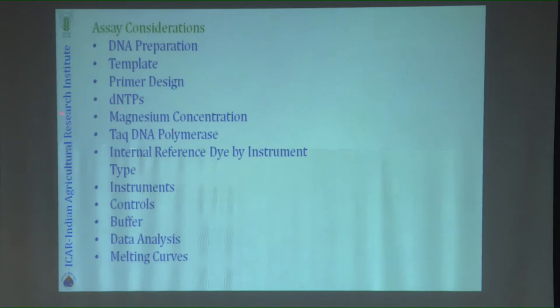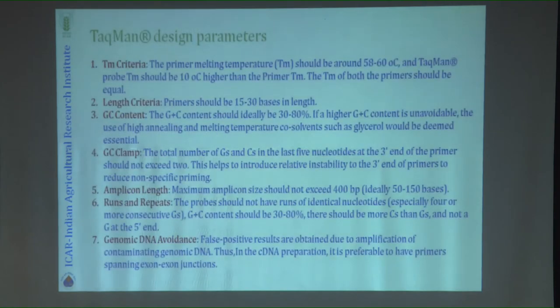Sometimes students, actually in my lab, they prepare everything, but they forget to add DNA. So I know one of my students, she carried out like 84 qPCR reactions and came and said nothing came out. I said, I'm gone. That day I had 50,000 rupees gone down the drain, right? So you should understand all these factors.